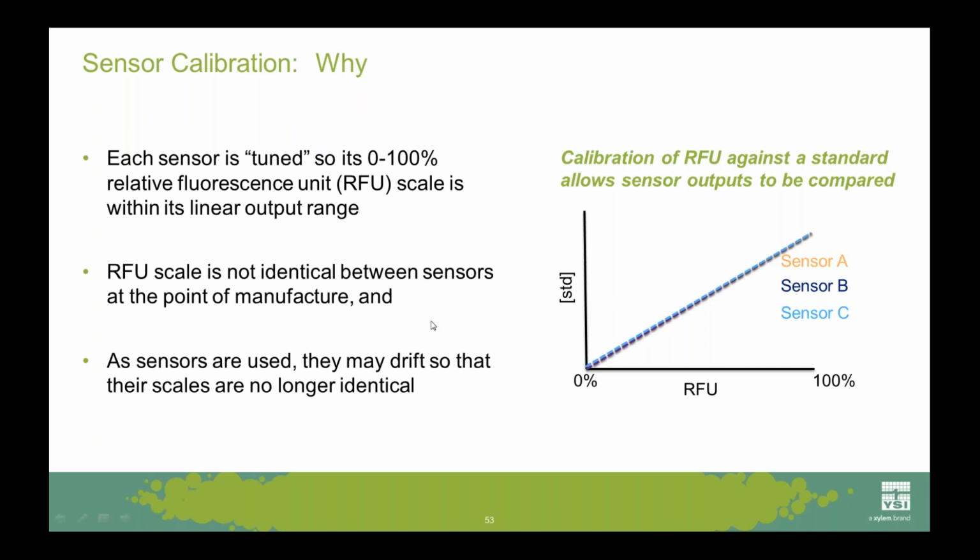So have you ever wondered why YSI doesn't just tell you when to calibrate a sensor? Well, it's because you have to decide how much drift is acceptable for you, and we should not decide that for you. So how frequently you calibrate really depends on your tolerance limits and all those factors I just mentioned in the last couple of slides.